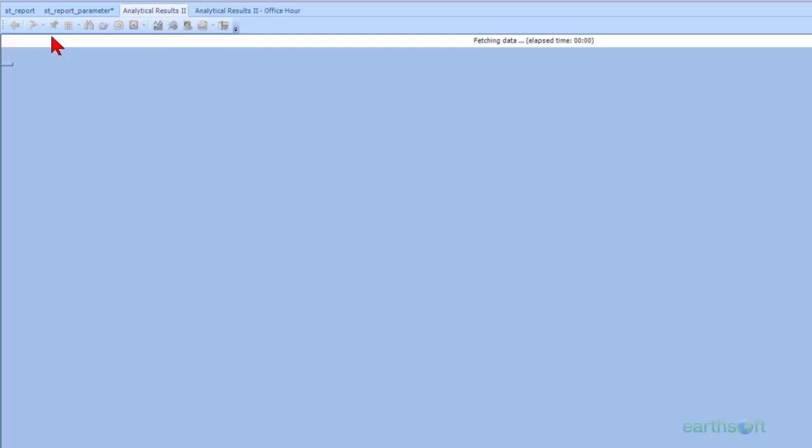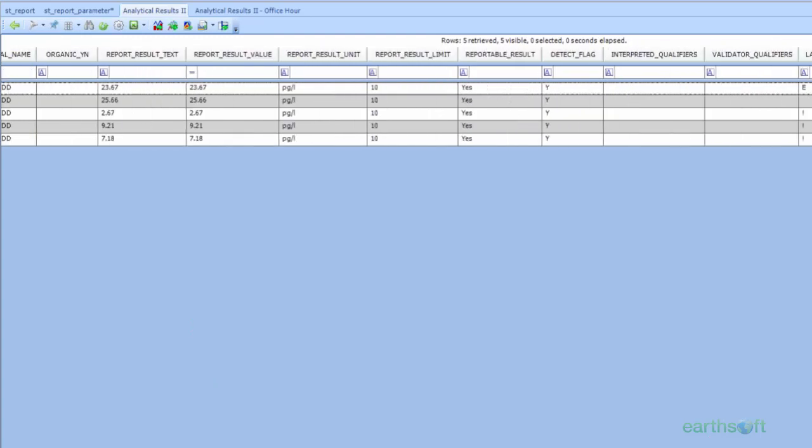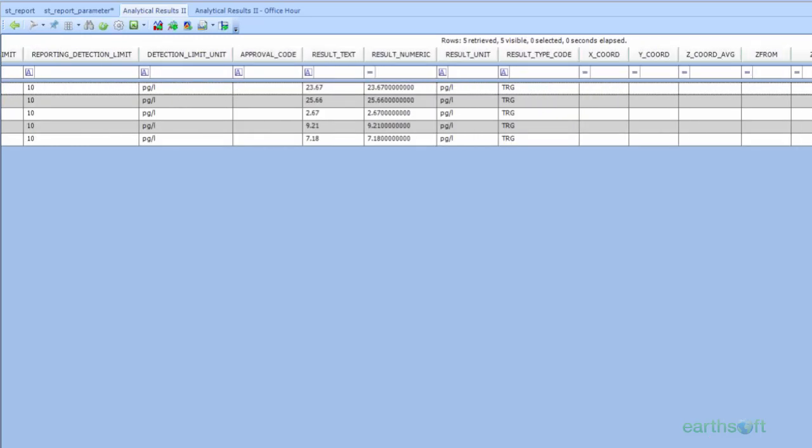Aha. And then if I run it, of course, I don't think there's depth range data for this data set, but that's neither here nor there. But yeah, so it would allow you to add that depth range information there if I had depth data there.